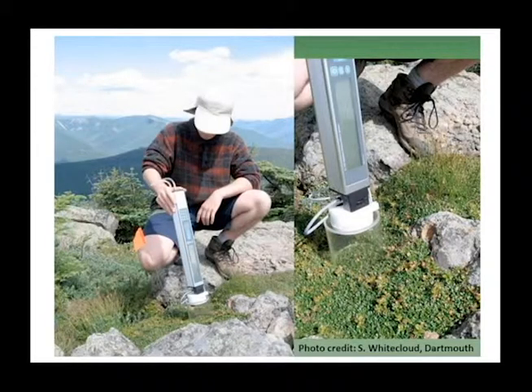So here we can see Simone. We can see her site is certainly at elevation. This white piece on top of the leaf chamber is actually our custom canopy chamber attachment accessory.